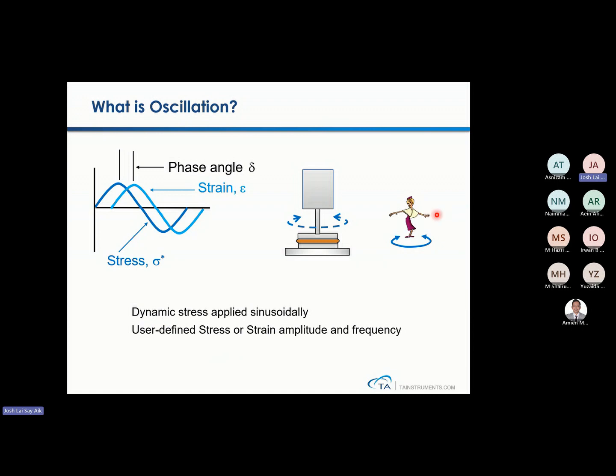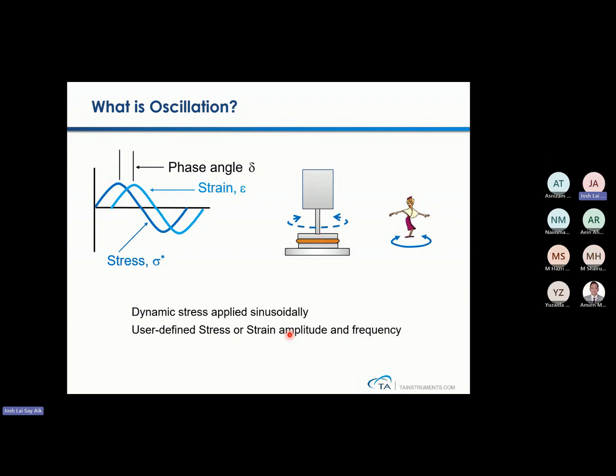Of course, this movement here can be low speed and high speed, so we need to govern it by the frequency as well. While how far it can go, I mean how tall it can go here, will be governed by the strain percentage or strain.